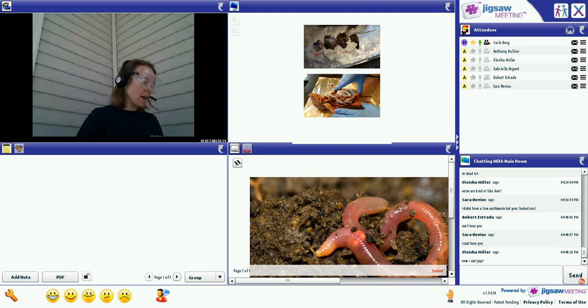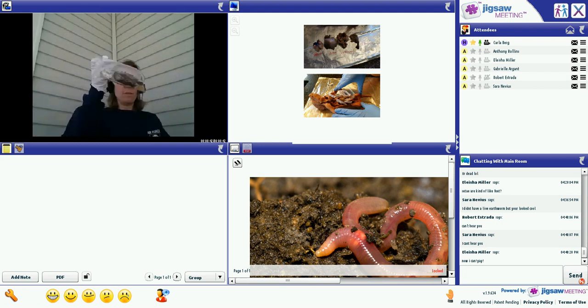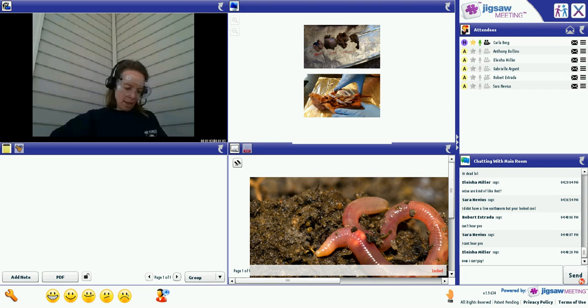Okay, so first things first, we need to get Earthworm out of his bag. So, you have your bag. Your earthworm is the long worm in there. That is the only worm. Go ahead and take him out and put him right onto your blue dissecting mat. If you have not pulled off the little plastic of your dissecting mat, you are going to need to do that. So take a second, get everything out.